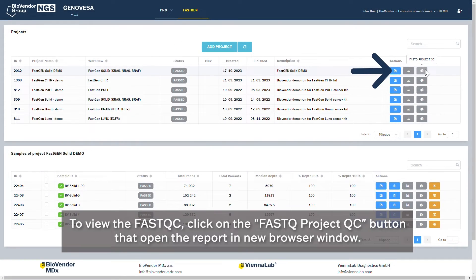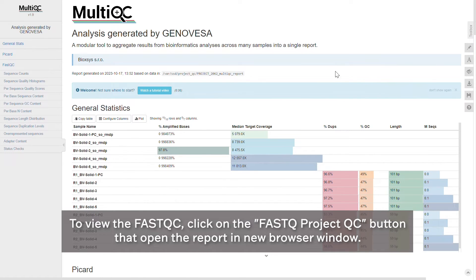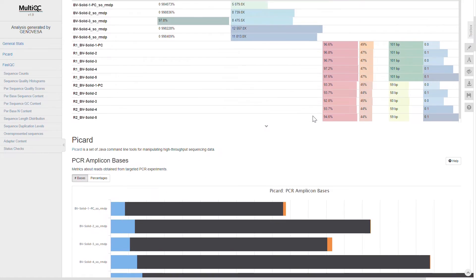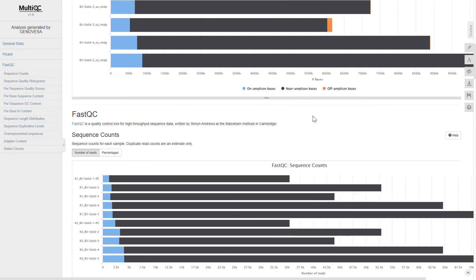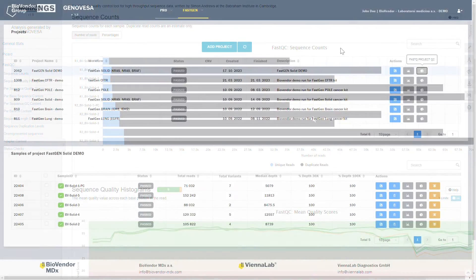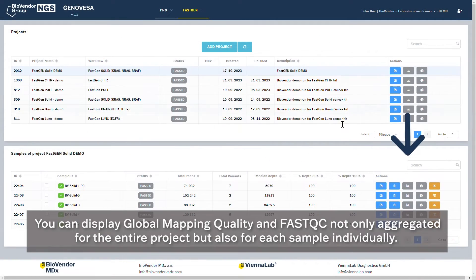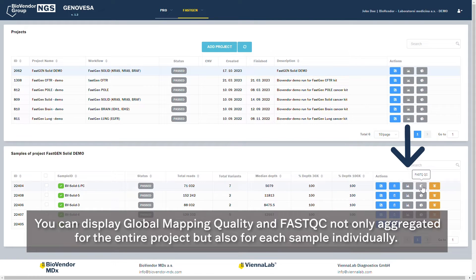To view the FastQC, click on the FastQ Project QC button, which opens the report in a new browser window. You can display global mapping quality and FastQC not only aggregated for the entire project, but also for each sample individually.